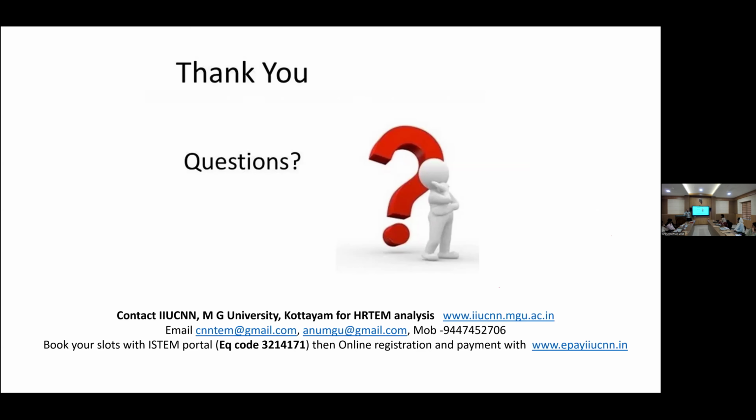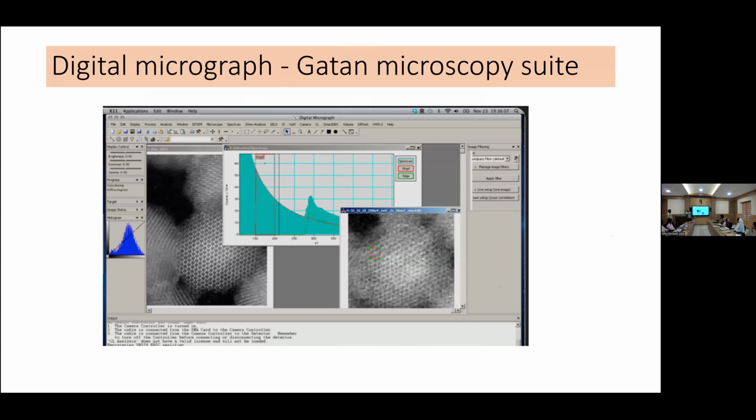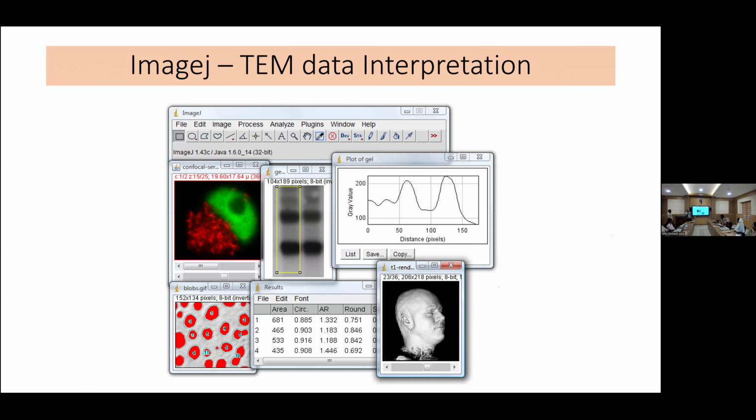I will show you, because there are a lot of tutorials available. It's very simple. You just load the sample, and the main thing is the scale. First we set the scale. You should be very careful about scale settings. Okay, I'll just show you how we can.